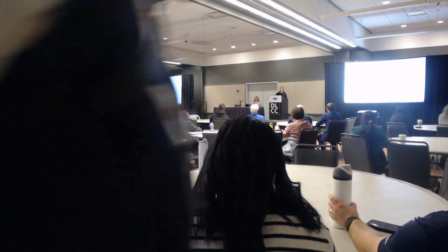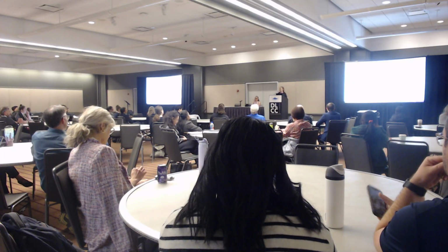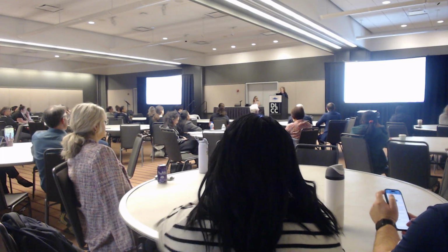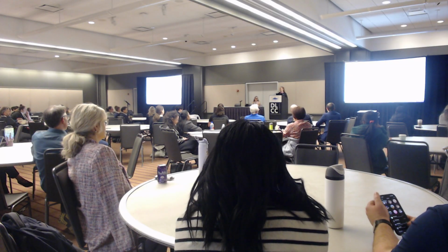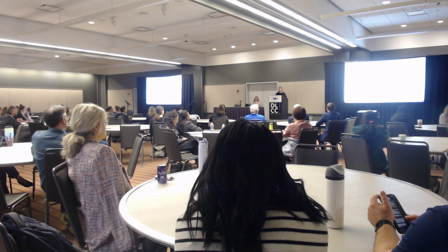What this does is it means that over 20% of the bases in your library are being converted, and this collapses base diversity and essentially collapses what was a 4-base genome into a 3-base genome. This has implications for sequence quality, for alignment, and it also limits the utility of these libraries to be specifically for methylation profiling applications.